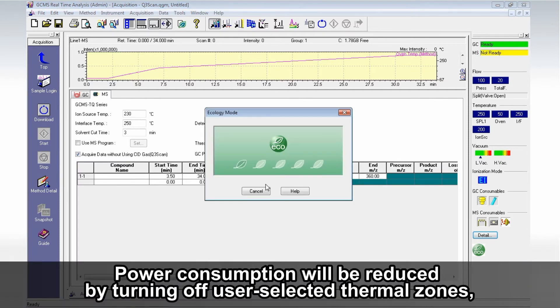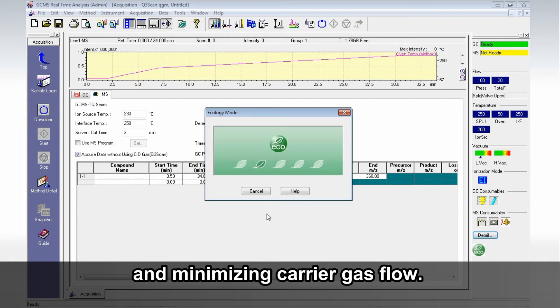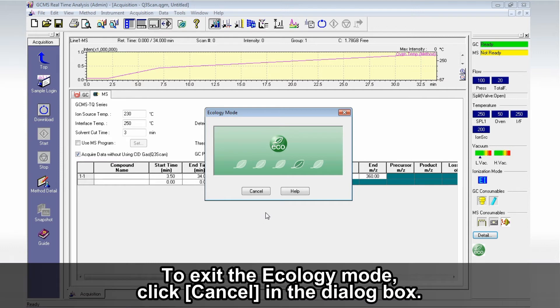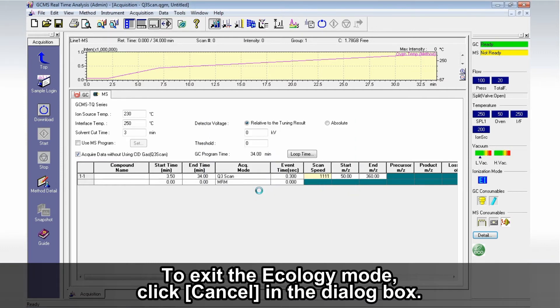Power consumption will be reduced by turning off user-selected thermal zones and minimizing carrier gas flow. To exit the Ecology Mode, click Cancel in the dialog box.